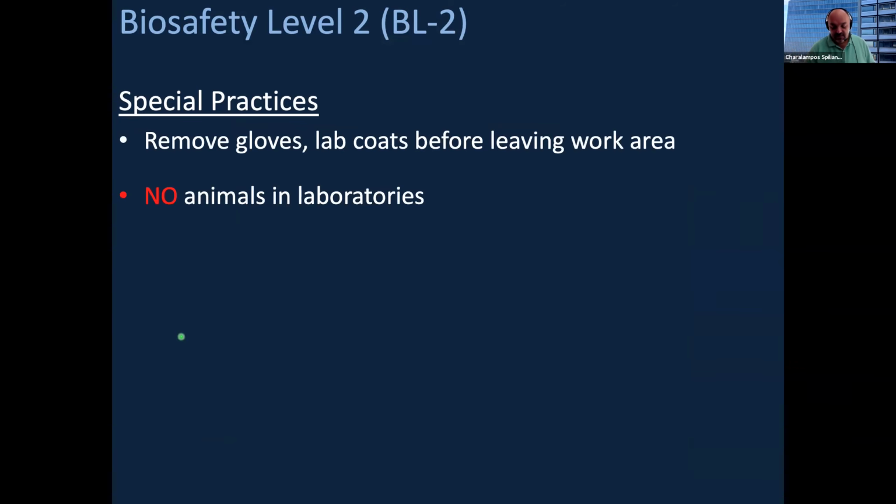Something quite important. I think almost everyone is doing this kind of mistake. We do wear lab coats in order to protect ourselves. And I mean protect ourselves because the biohazardous material or agent will be spilled on the lab coat. So when you leave the lab area, you should always leave your lab coats within the lab. Otherwise, you move around with a biohazardous material, and this potentially could contaminate other areas within the institute. So when we exit the lab, we should take out our gloves and also the lab coats.